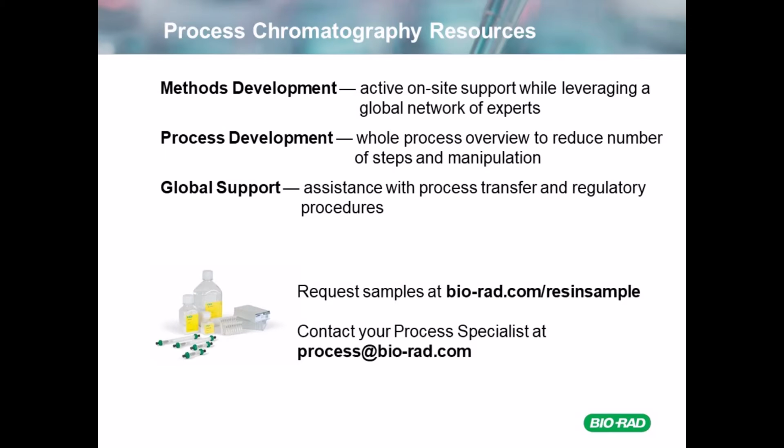For these studies, we used fresh resin. The pre-pack columns had never been used before, and the resin for the DOE was also new resin. This is fairly common for early phase studies, but as you get later into your development and into your lifetime validations, you will actually see studies involving used resin.